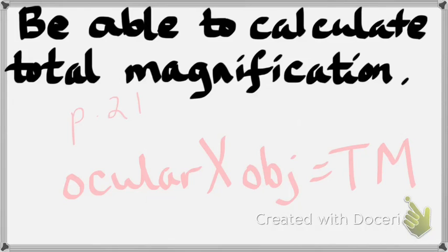Clarissa, would you point out the magnification of the ocular to Kelly, because she's not seeing the correct number. Kelly, go look. On the ocular. The ocular refers to where your eye goes. There's an X past the 55? No. Looking for a number with an X. I know you guys found it one day because we all did it together. I know what's on that scope. It was covered by the little rubber. So what is it? It's 10. Okay, so the ocular is 10.